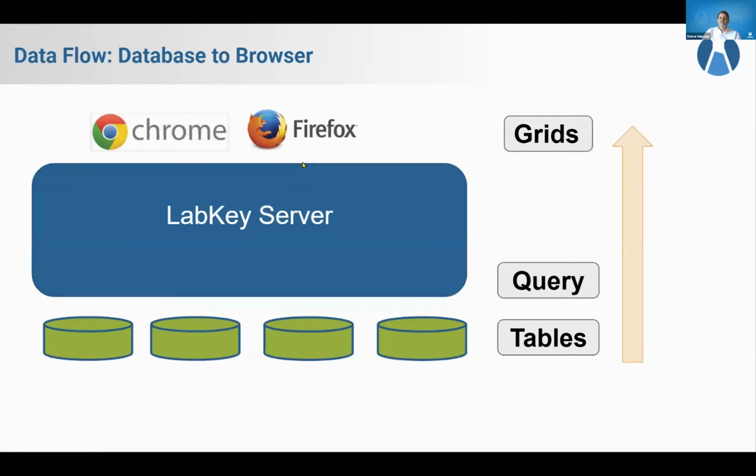And here's a kind of graphical picture of everything I've been talking about. I think of the whole LabKey environment as having 3 levels. There's the browsers, which talk to the server, which hovers over the databases. That's what those green shapes are.